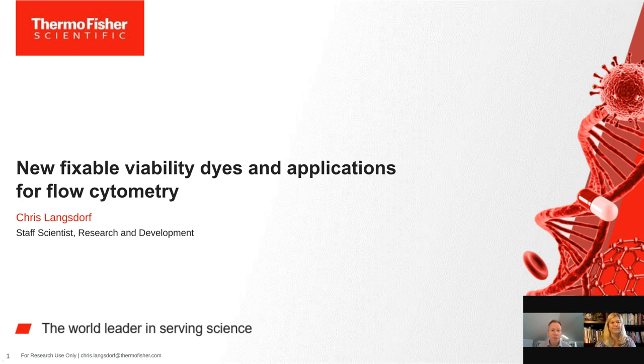Yeah, definitely. Thanks for the question. And this is a key concern now that we're seeing a lot of research pivot from conventional cytometry into the spectral space. And more specifically wondering how these dyes can be optimized to perform on a spectral cytometer. So first, I just want to mention that we have some great guidance available on our website on thermofisher.com. There's a full spectral cytometry page with guidance about designing panels for spectral cytometry.